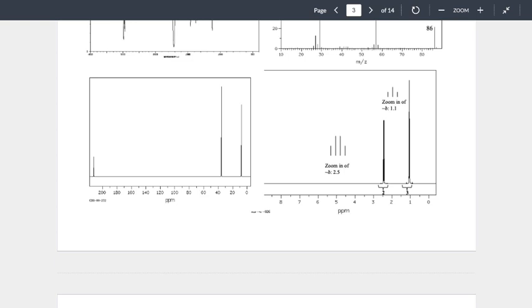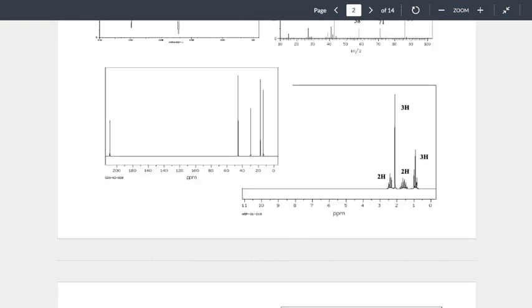I don't see the 1H, 2H, 3H stuff anymore, but what I am seeing is this little bracket with a number underneath. What is that? That's the same thing. That's the integration information. It's given to you underneath. When we consider how NMR is produced and how we run spectra, that's the default. That's how it should always be given to you. You should never see it as this H stuff, because that H stuff is now the instructor trying to give you more information than you should really have access to.